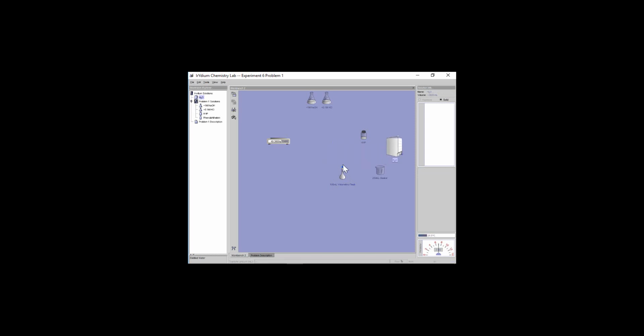Now I have my standardized KHP solution. This one here, I made it. This is going to be roughly 0.9 molar. I was told that the NaOH was about 1 molar. I made these very similar so that I'm not going to be wasting a ton of one chemical or a ton of the other chemical. At this point here, I'm ready to do my titration.